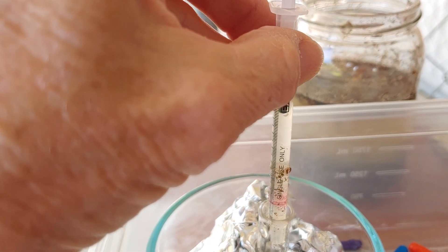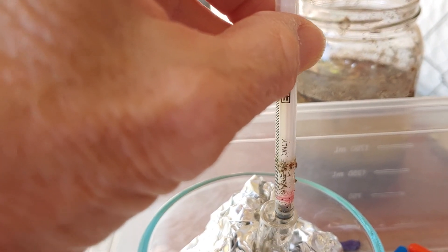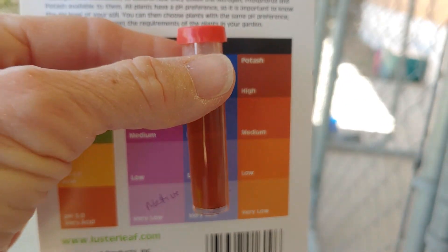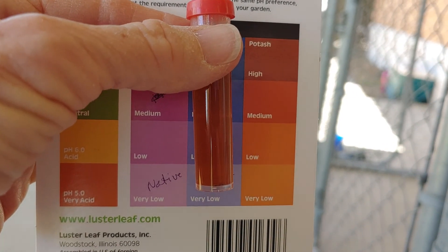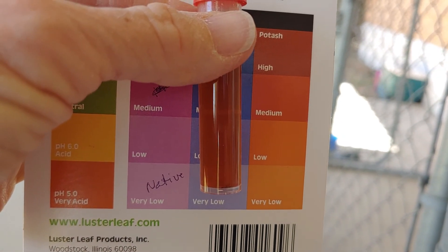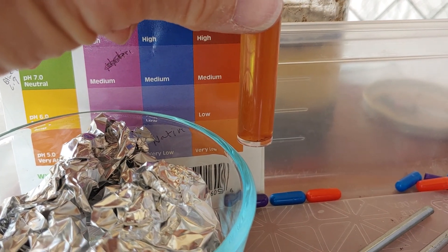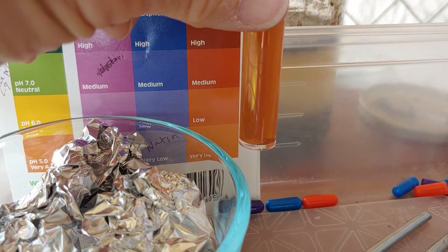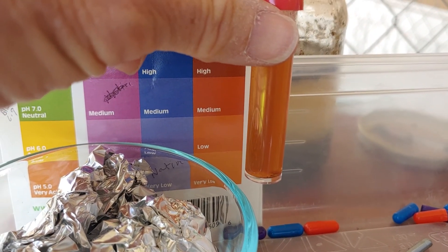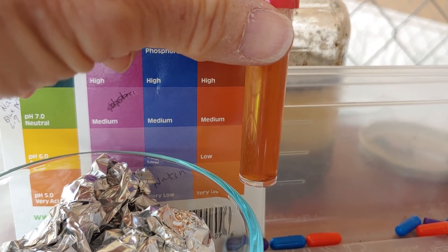Now I'm testing for the potash or potassium — that's the red capsule. Here is the potash result. I think it is low. You can see it's not as dark as medium and not as light as very low. I'm going to call it low.